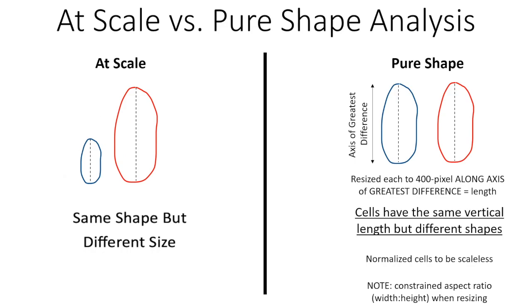Another important consideration is the scale of the cells. When we applied the LCPC transform to the cell outlines taken directly from images provided by Dr. Eaton and Dr. Selmer, the cells had different sizes and shapes. These shapes were referred to as sickle cells at scale. However, shape is distinct from area.